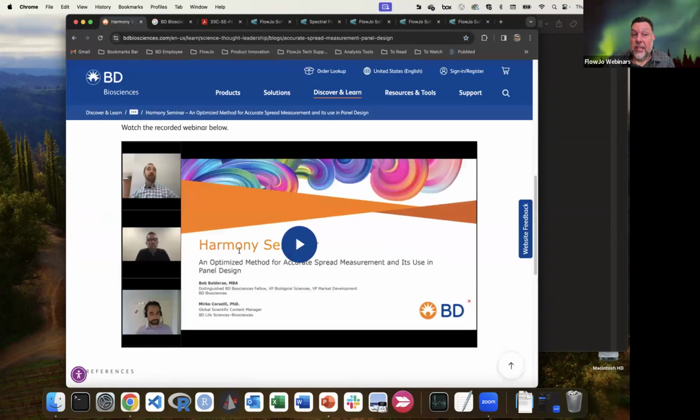This is the page on the BD Biosciences site with the SSM TSM discussion, and it is a very good webinar if you want to use those tools for instrument performance monitoring versus panel design with the total spreading matrix. I found it very insightful.